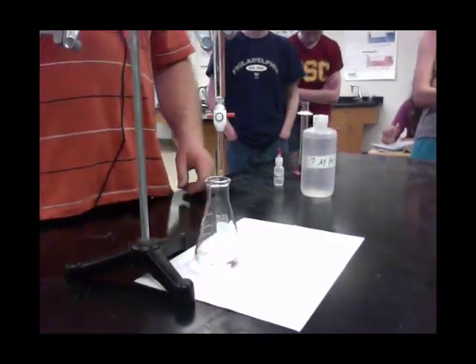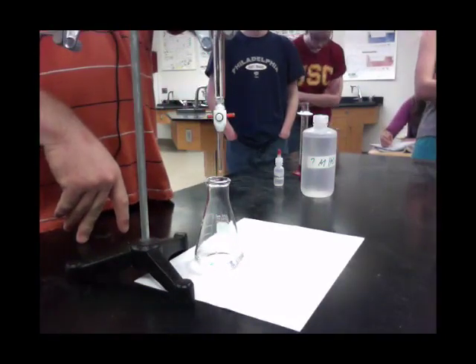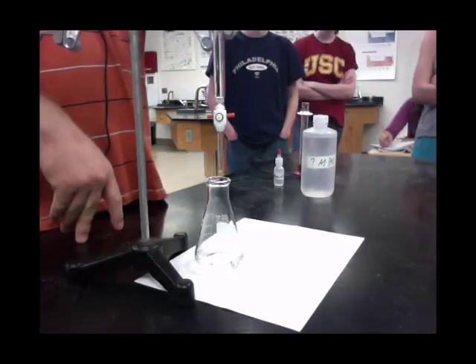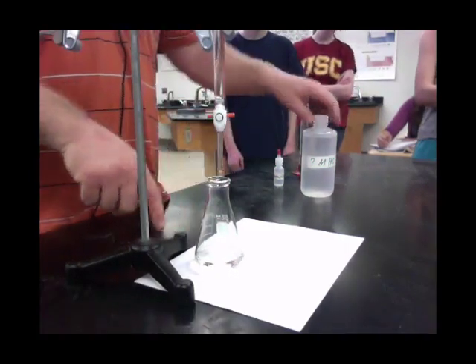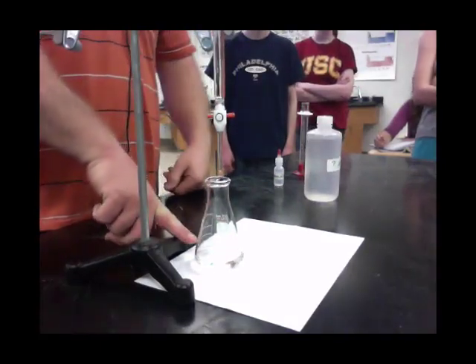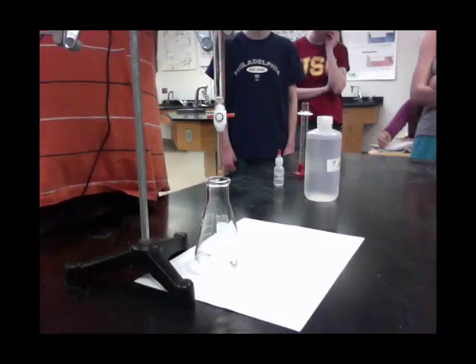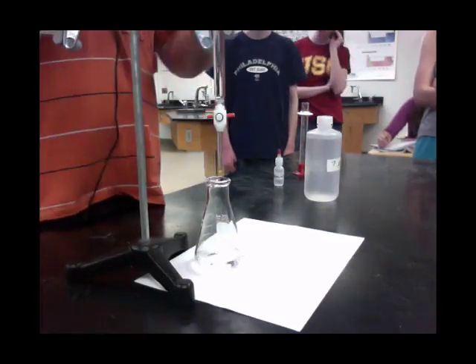In the burette we have 0.25 molar sodium hydroxide, so we can record that: our concentration in the burette is 0.25 molar. The concentration of the acid we have no clue. We used 24.90 milliliters of acid, and now we're going to figure out how much base it takes to neutralize it — basically get to that pH of 7.